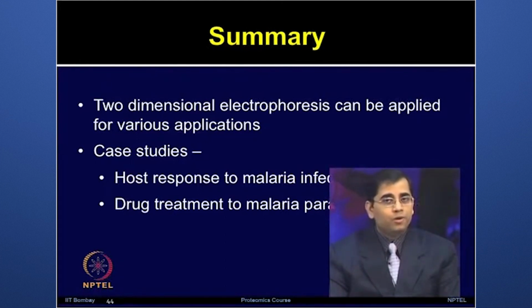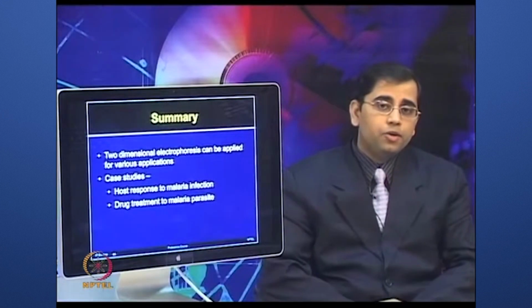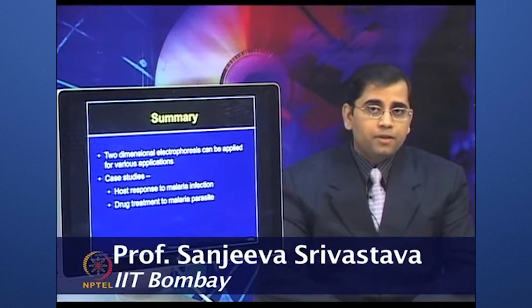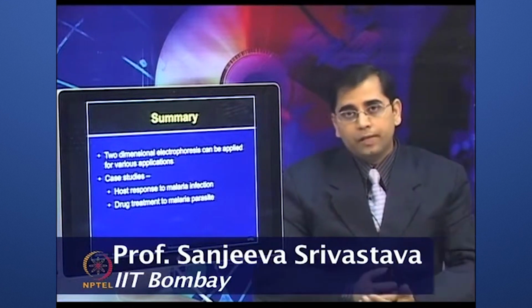Although I thought I would be able to cover two case studies on malaria, one on the host side, like how host response can be monitored due to the infection of Plasmodium vivax, and a second study based on the effect of a drug on another Plasmodium species, Plasmodium falciparum, we could not discuss the other study on the drug treatment of the malarial parasite, which we will discuss in the next class.